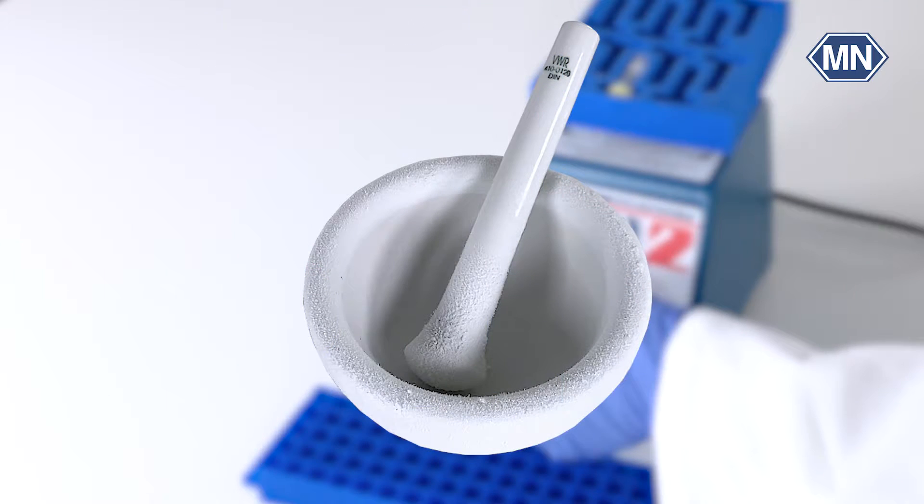Our second method involves a more traditional approach: the trusty mortar and pestle. This age-old tool is used to physically grind and crush your samples, making it ideal for smaller scale applications. It's a simple yet reliable way to liberate nucleic acids by breaking down cell walls and membranes.